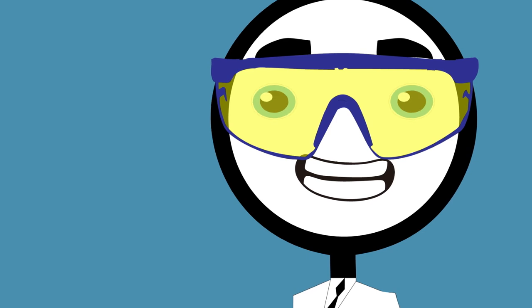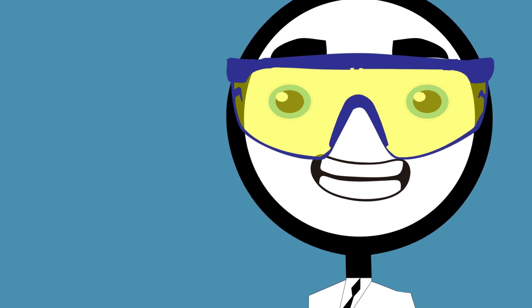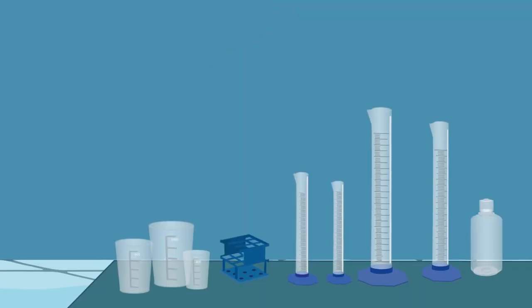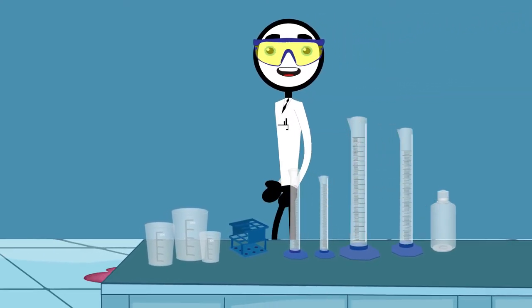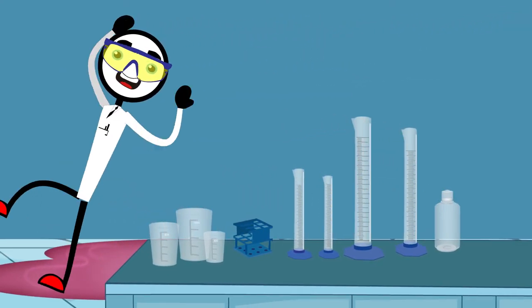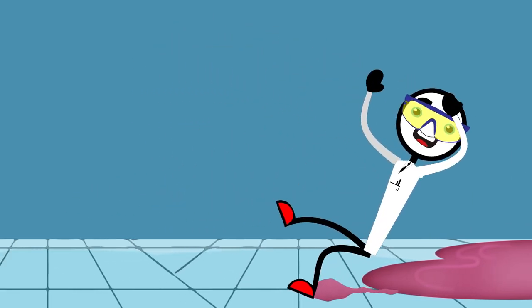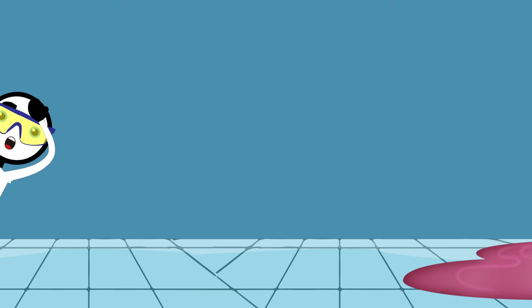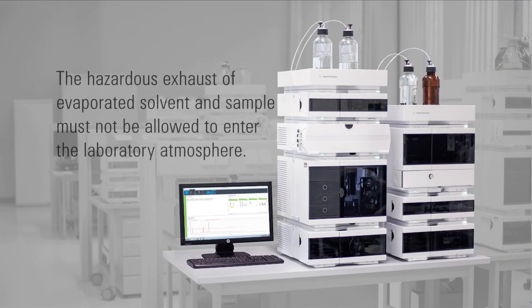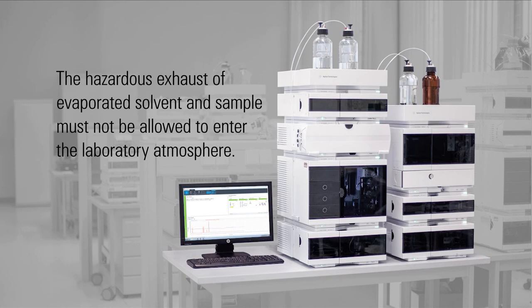Shortly after he installed his LC, Chris's liquid waste that was supposed to filter into the waste container beneath his module ended up on the floor. He slipped and broke his foot. On top of his hospital bills, he also ended up with a hefty fine for not properly disposing of the residue. The potentially hazardous exhaust of evaporated solvent and sample must not be allowed to enter the laboratory atmosphere.